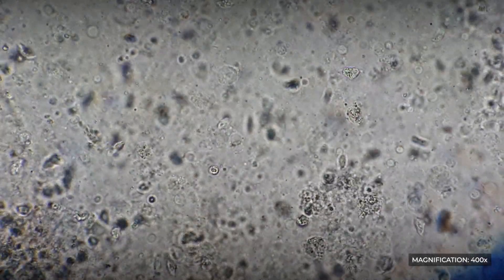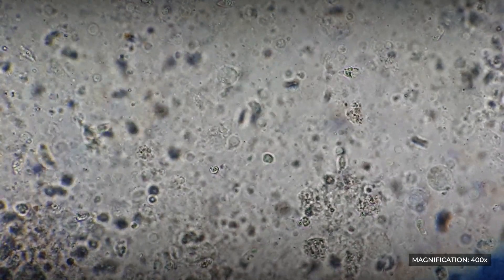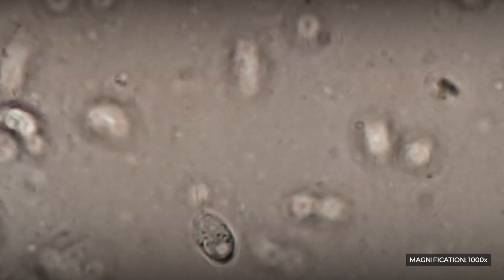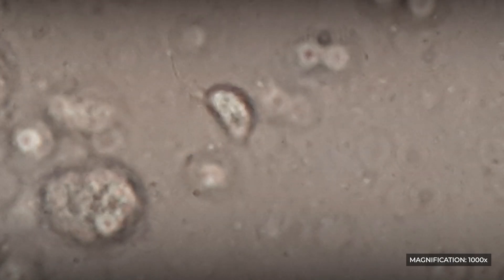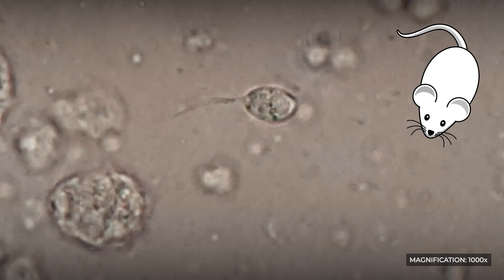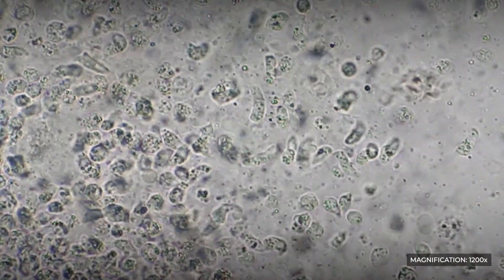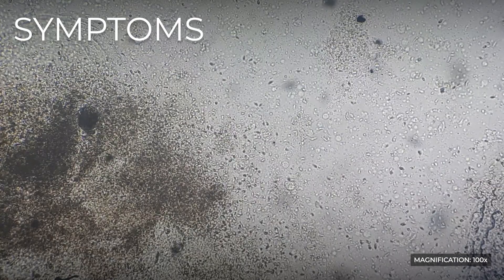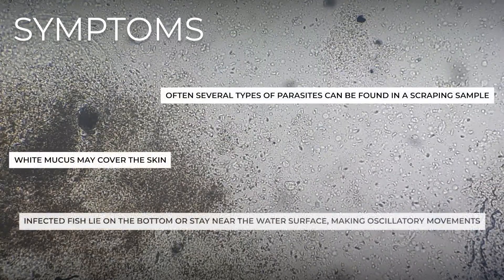At high magnification, the difference between Ihtiobodo and Cryptobia is visible. Cryptobia have a slightly elongated shape and full body with a pointed nose, resembling mice with tails, and the parasites themselves are very pliable. The symptoms that fish exhibit are similar to those of infection with Ihtiobodo nicator.